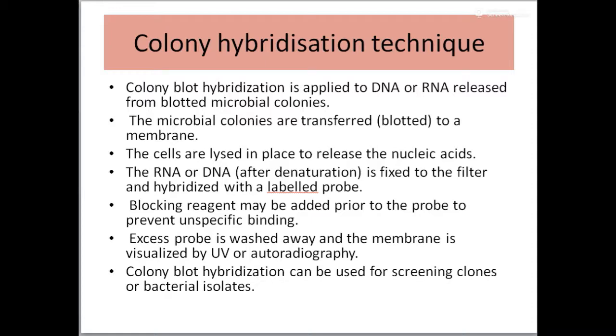Here, you use the DNA sequence of the desired gene of interest, and you take each and every colony and check whether that particular sequence is there in the host. So it's a confirmation that your host cell does contain the gene of interest. At the nucleotide level, you confirm it.